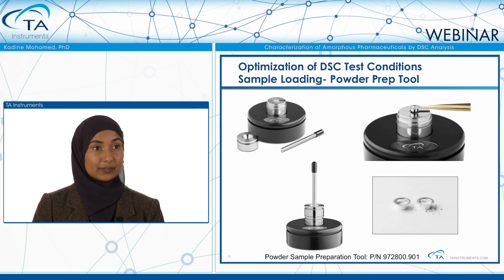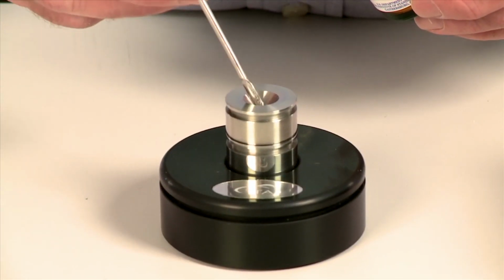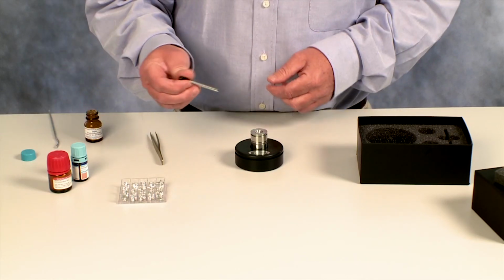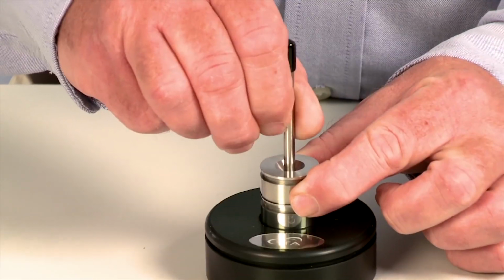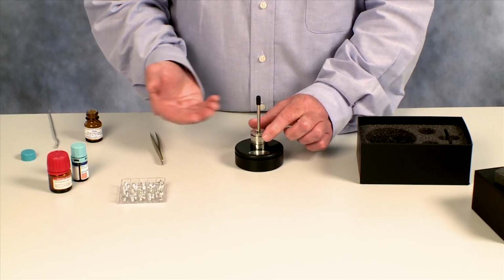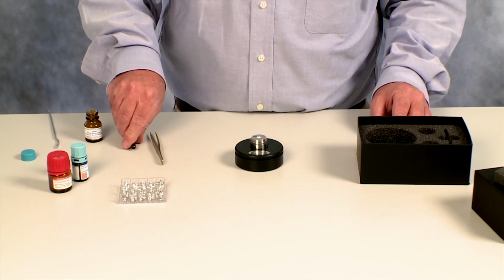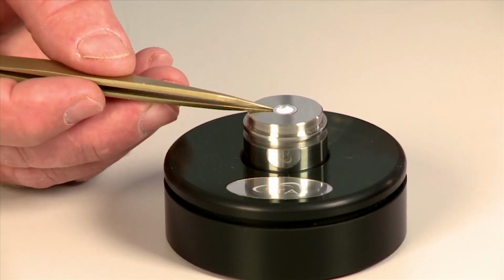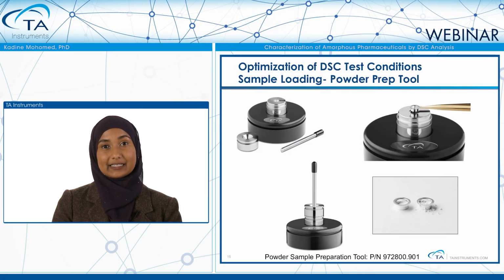a DSC aluminum pan. This particular tool utilizes a funnel as well as a plunger to very effectively, efficiently, and cleanly get sample into the pan without getting a bit of contamination on the lip of the pan, thereby allowing you to get a proper hermetic seal between the lid and the pan if needed. For a full version of that TA Tech Tip video, please visit our website or YouTube channel.